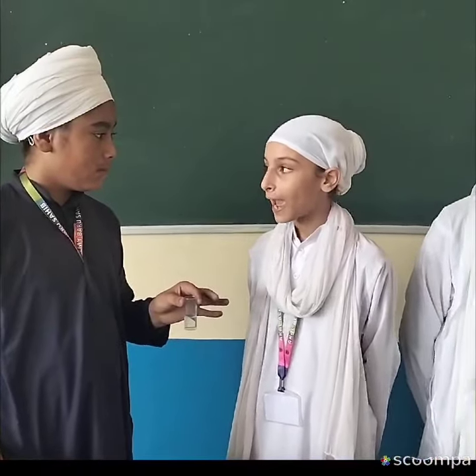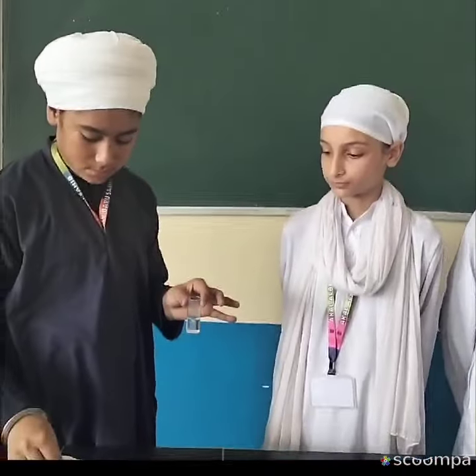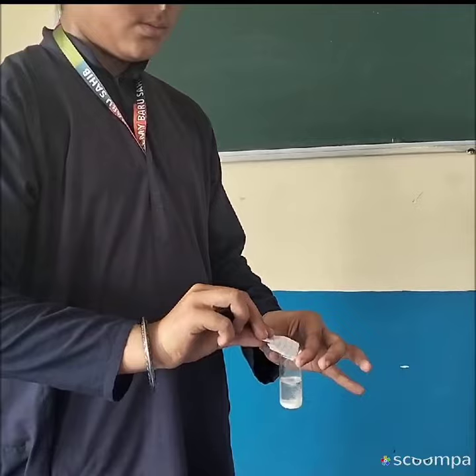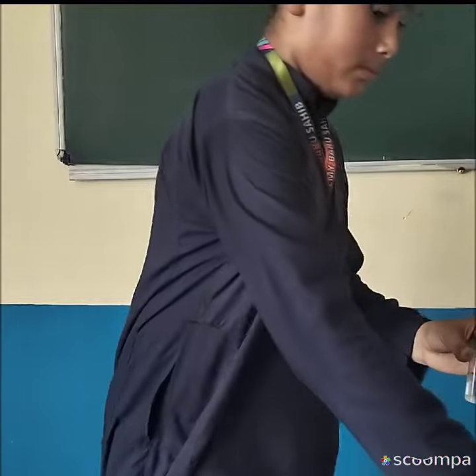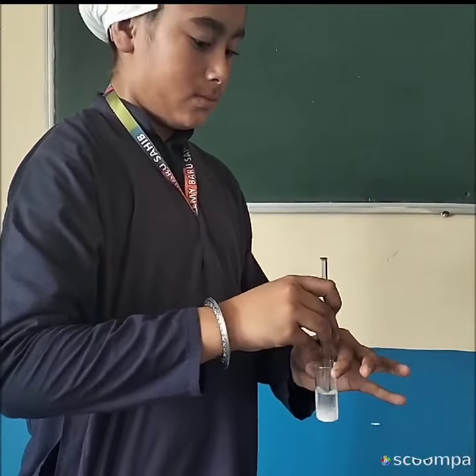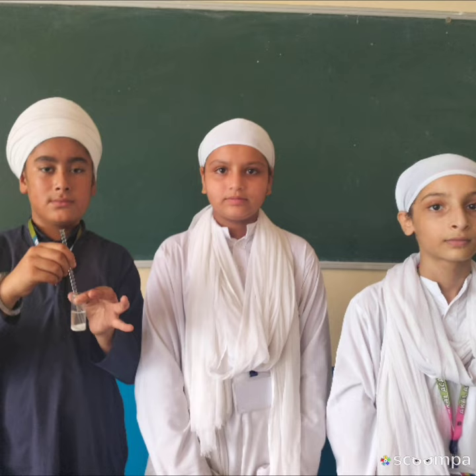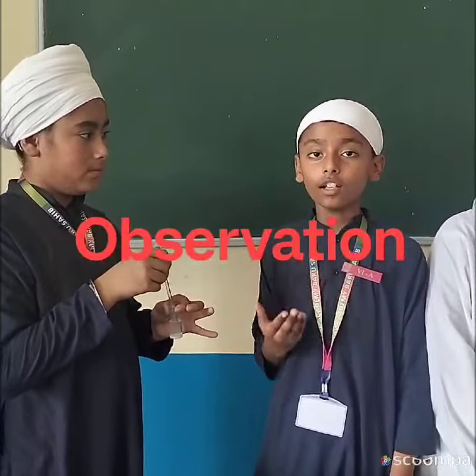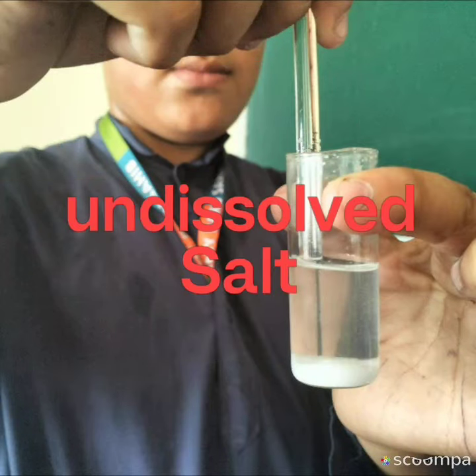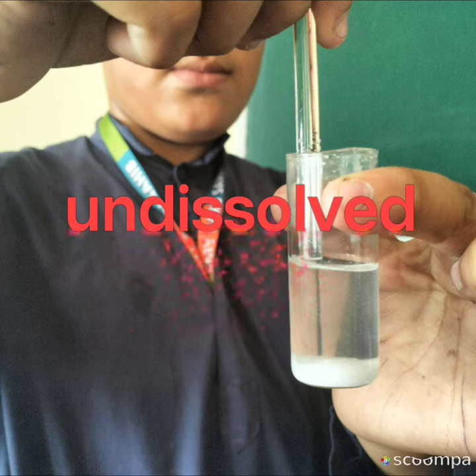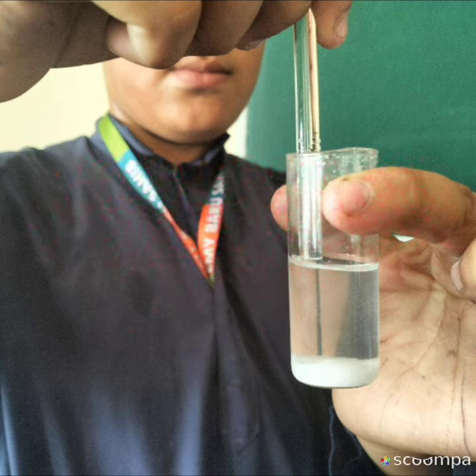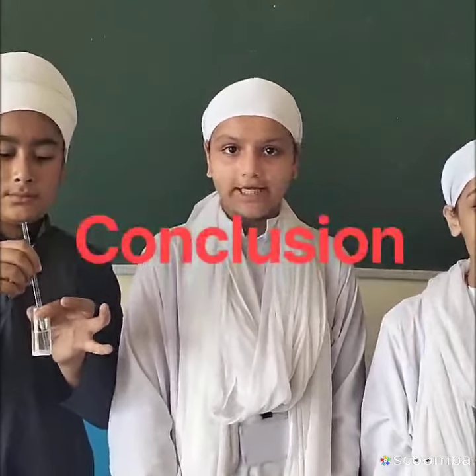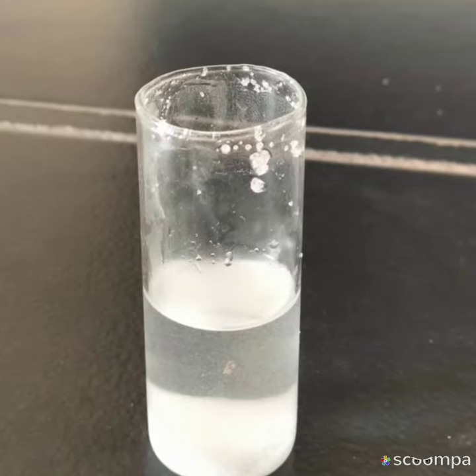Then open the bottle and shake it for some time and observe. After some time, you will find that some solid remains undissolved. The undissolved solid settles down at the bottom in the tube. Water can dissolve only a certain amount of substance — the water cannot dissolve any more once it is saturated.